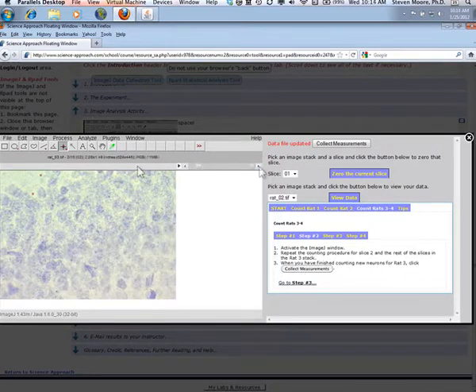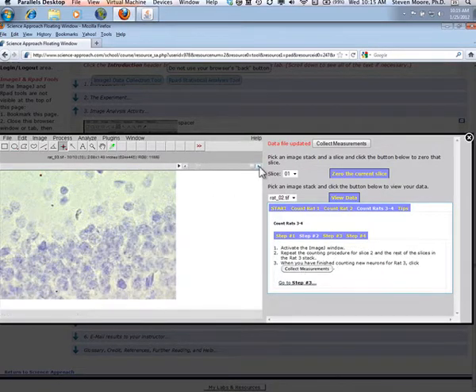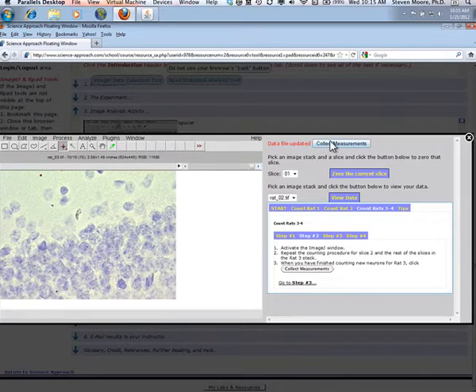Click Collect Measurements at the end of stack 3 and then move on to stack 4.